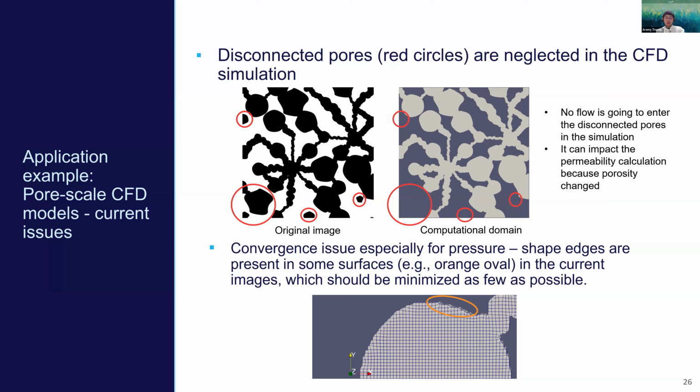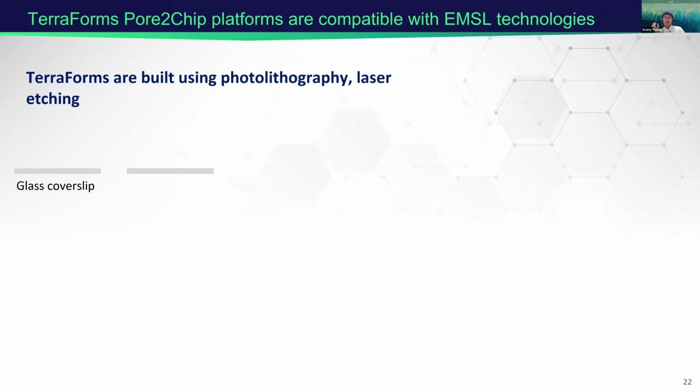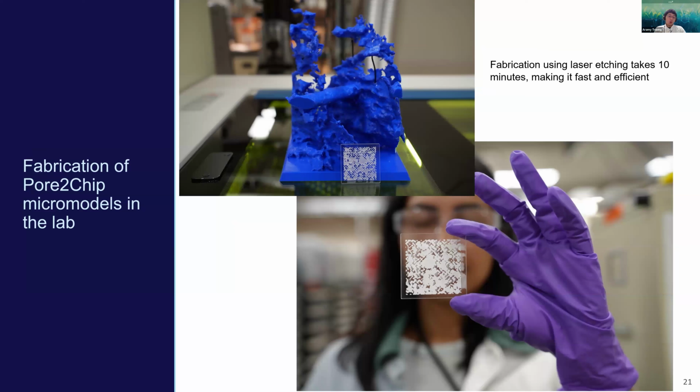In terms of the size, it depends on which method you want to use. If you're talking about fabrication, on an actual chip, if you just wanted the two-dimensional design, it is totally scalable since it's digital. But when it comes to the actual physical chip, if you wanted, let's say, as small as 3 by 3 millimeters, then we could make a micro model that small.